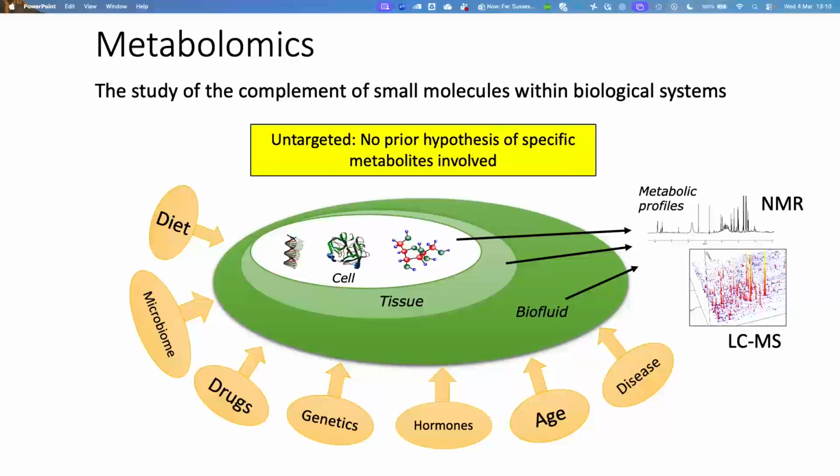But the primary thing about metabolomics, and it's the same with other omics fields in general, is we try to measure as many things as possible, and we don't at the beginning have a hypothesis about which of those molecules will be involved in the disease. So if you can imagine genomics, for example, we might want to look at the entire sequence of an organism and work out which parts of that sequence could be related to a particular biological process or when a biological process goes wrong.